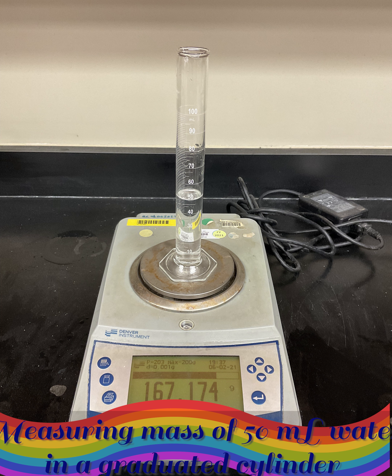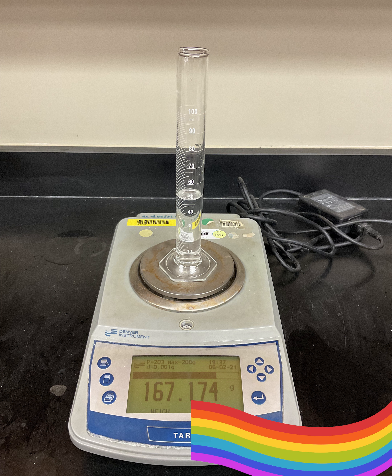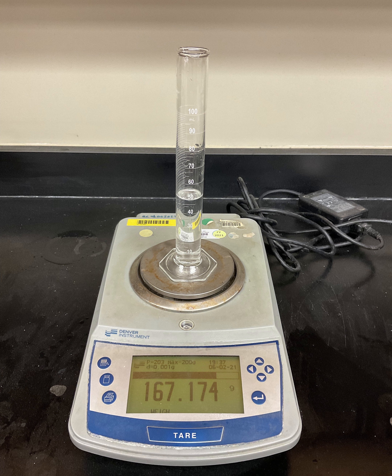Next, we will measure the mass of 50 milliliters of water in a graduated cylinder, including the mass of the cylinder itself.